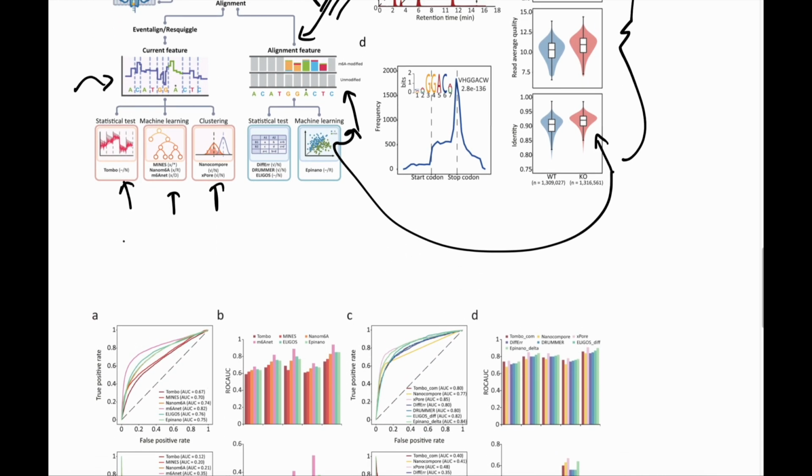And therefore, there were two different kinds of comparisons. One with single mode tools, which were defined to have no control sample, so they did not have this unmodified, and compare mode tools, which used the control samples. Certain tools only work in compare mode, certain tools only work in single mode, some work in both.